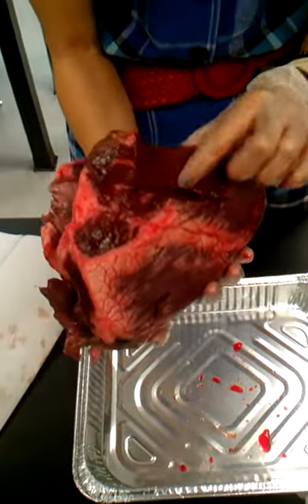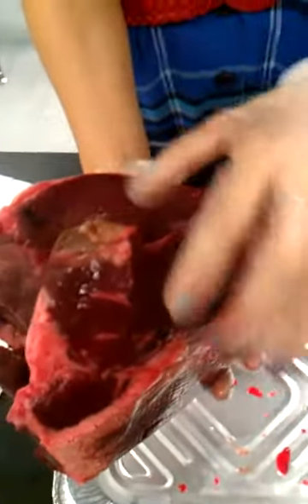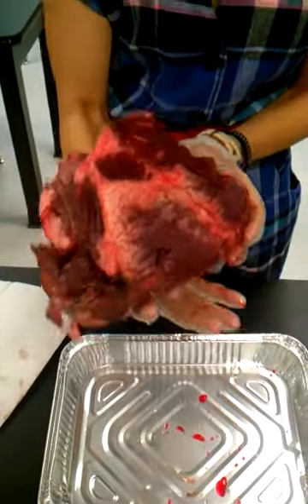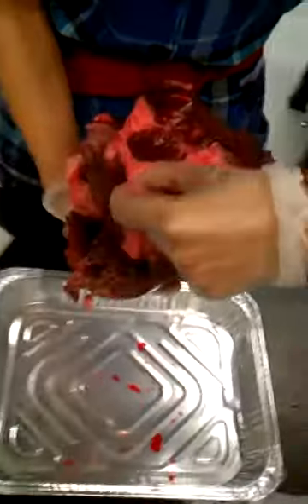muscle tissue in there. If you come and look closely, it's very flexible. But together, this entire muscle is a very important organ for the circulatory system, and this is a cow's heart, which is why it's so big. So there's different types of tissues. There's white tissue, which looks like fatty tissue really.